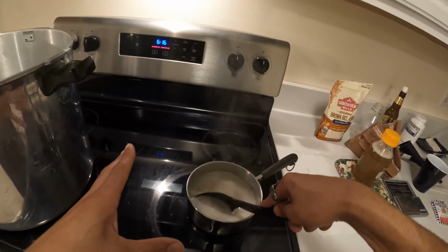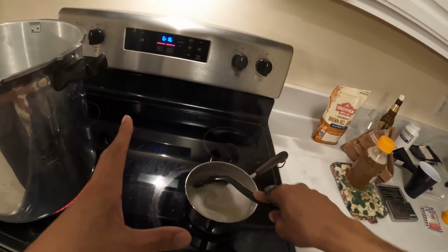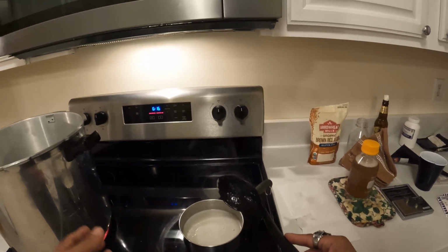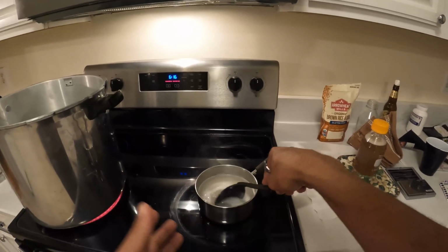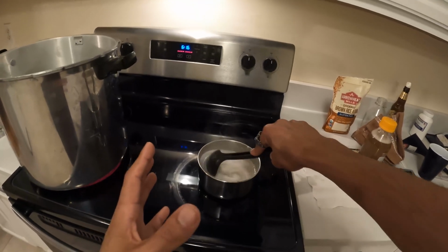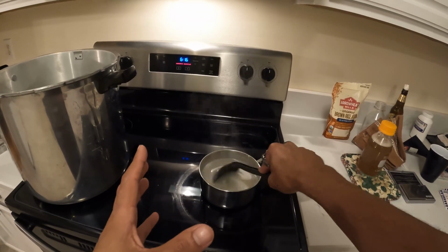This is the brown rice flour and the agar. Now I'm often working with multiple recipes at once. I might have these two, grain water, brown rice flour, the light malt extract. I might make a sawdust agar. I might make an agar with horse poo. Just depends on what I'm trying to do.